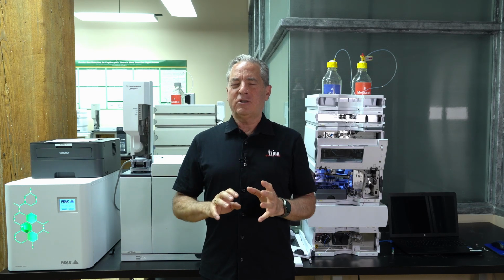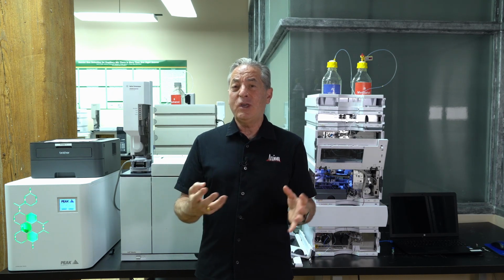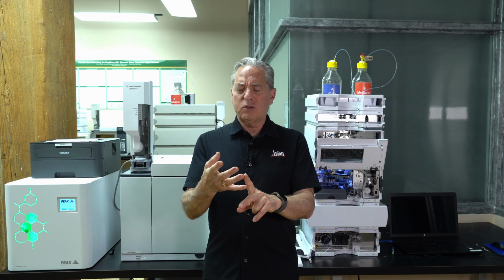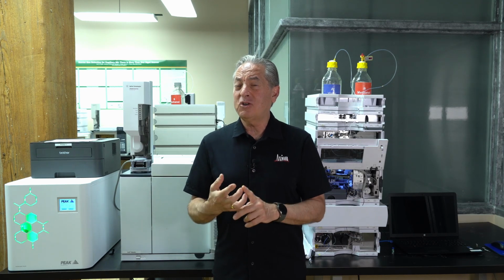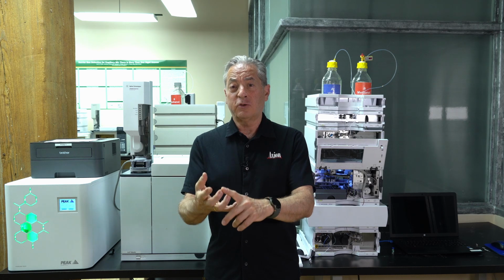So the answer to this question is, there's three things that affect resolution. Only three things. We call them capacity factor, selectivity, and efficiency. But the bottom line is one of them must be bad, and we need to figure out which one it is. These are easy to measure. We can measure them, compare them with what they're supposed to be, and then correct the one that's wrong.